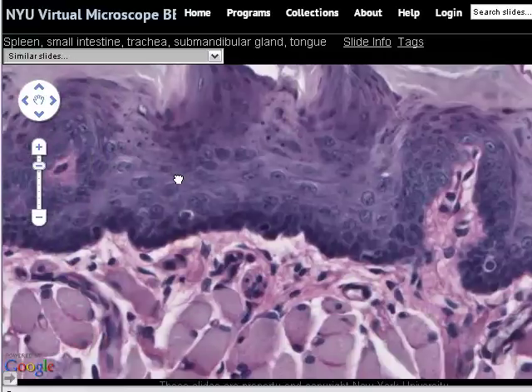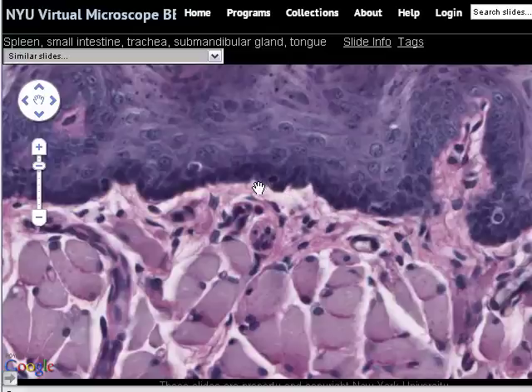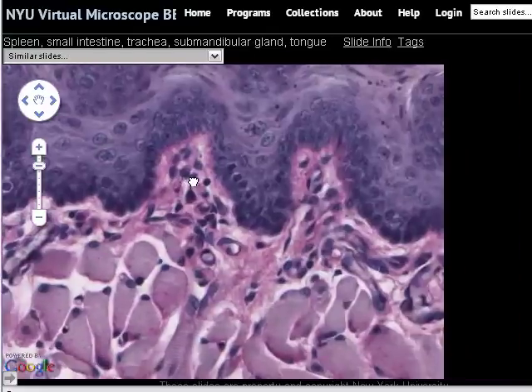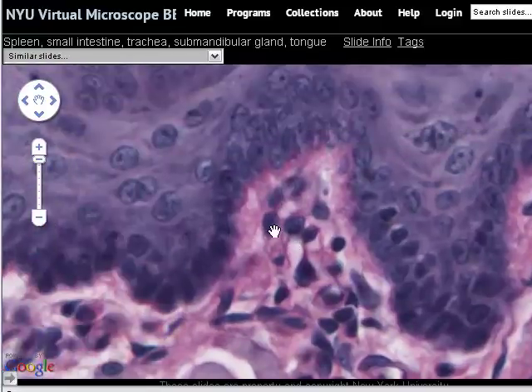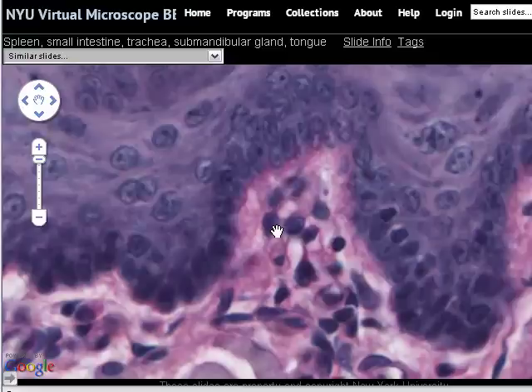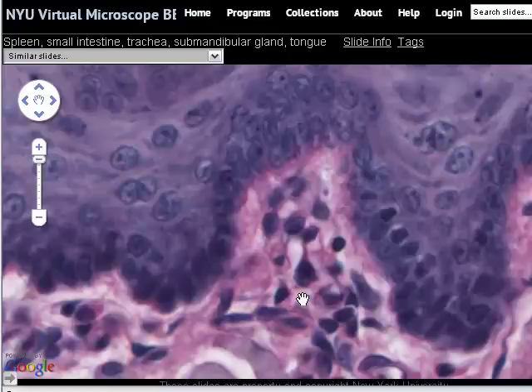Underneath the epithelium, the basement membrane doesn't stain, but we can see where the final internal layer of the epithelium is. Beneath the epithelium is a thin layer of pink material, and this is a connective tissue. Because it's found directly beneath the epithelium, this is most likely loose connective tissue. We don't see big collagen bundles; rather, we see pink interwoven collagen fibers, and this material is quite cellular, as we can see from the nuclei. Many of these cells will be fibroblasts, but some will be other connective tissue cells migrating to and from the area just beneath the epithelium.